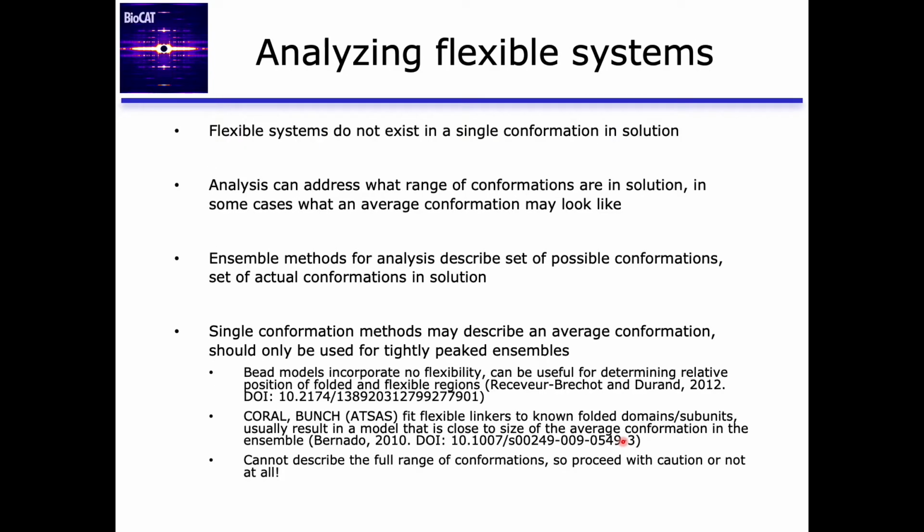All right, so once you think you have flexibility, once you know you have flexibility, you want to do some kind of advanced analysis to learn more about your system. So flexible systems do not exist in a single conformation in solution. That was the definition that I started with.